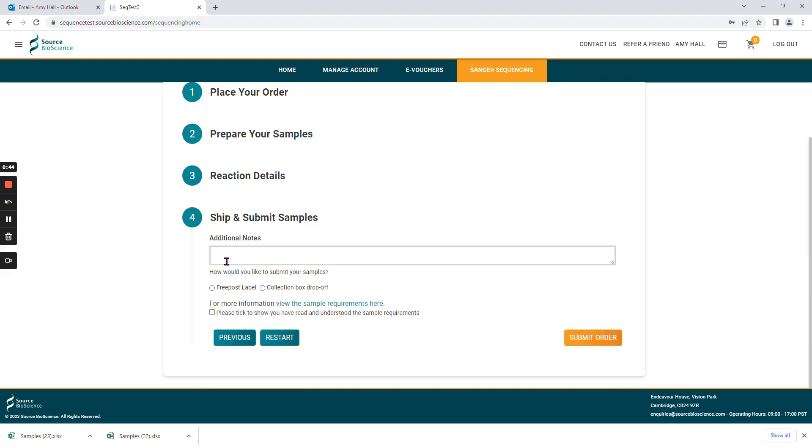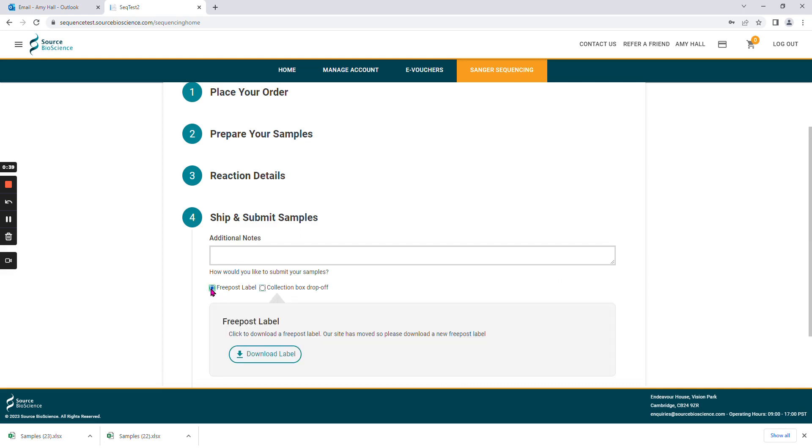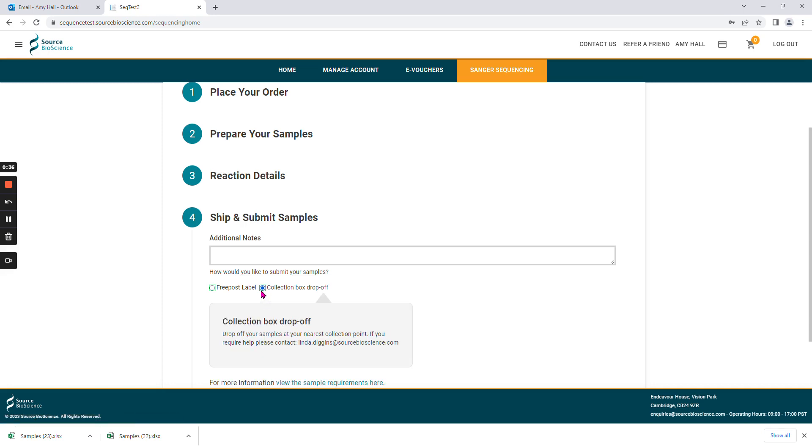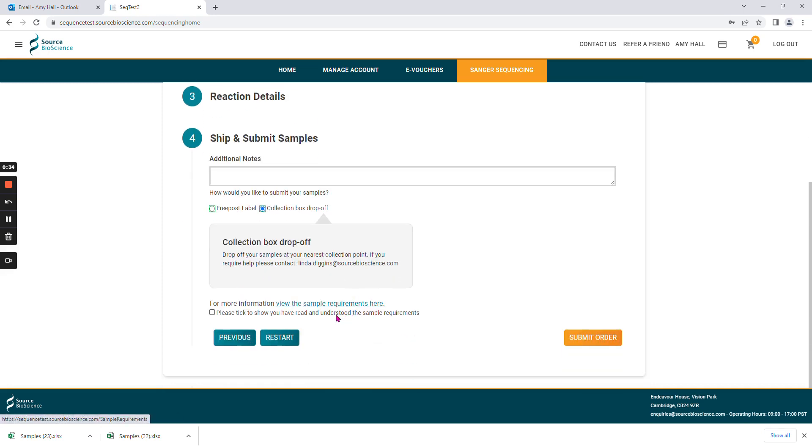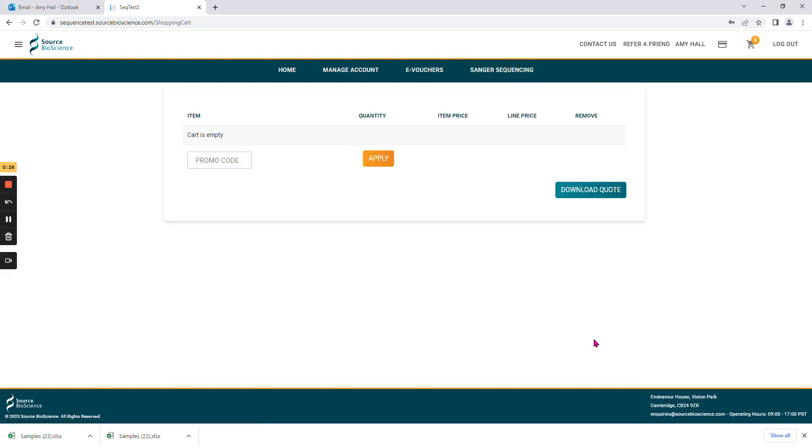Here you can add additional notes to your order and choose how you wish to submit your samples to us. If you choose free post label, you can download it here, or you can choose collection box drop-off. Please then read the sample requirements by clicking this link, and then tick to say you understand them, and then submit your order.